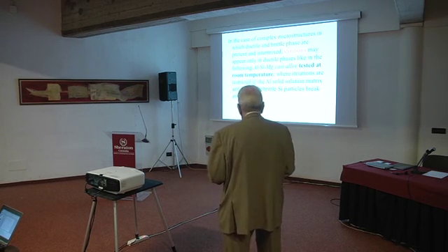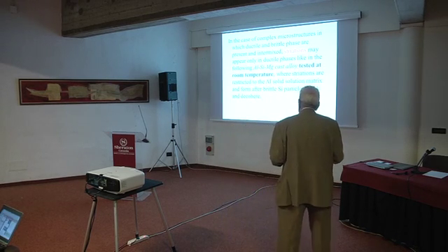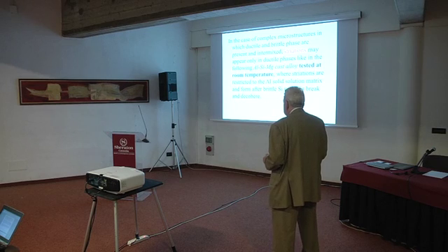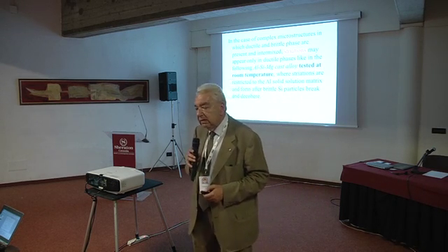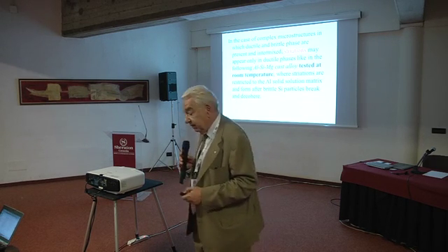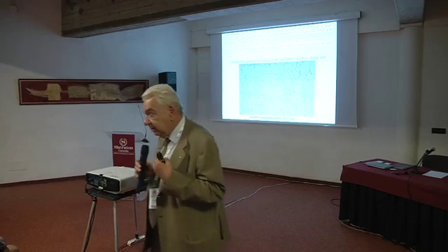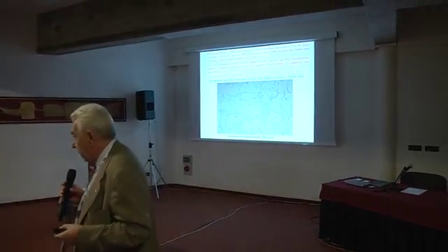One of these cases we'll see better after is an aluminum silicon magnesium cast alloy tested at room temperature instead of the 150 or 250 degrees C that we were having before. Now, let's go and examine the microstructure.